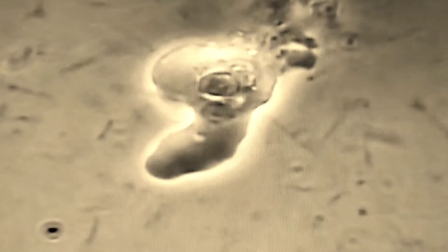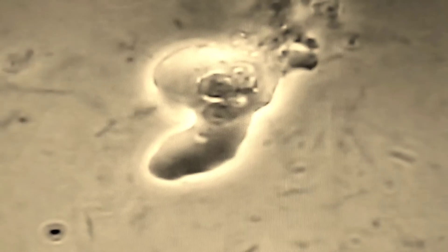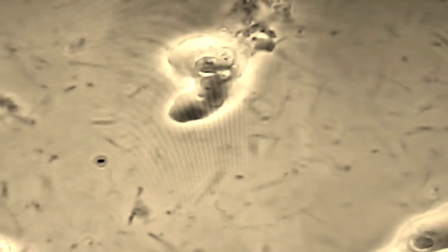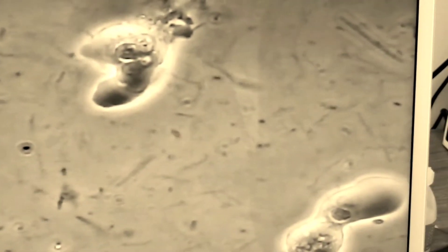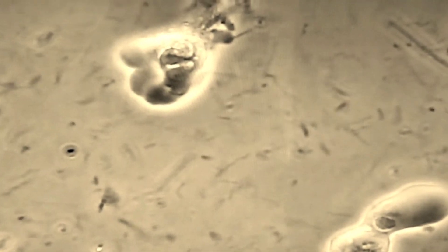You can tell they are by the way they bulge out in multiple directions. Some white blood cells will drag their cells along as they move, but amoebas bulge out in all different directions and they just engulf everything.